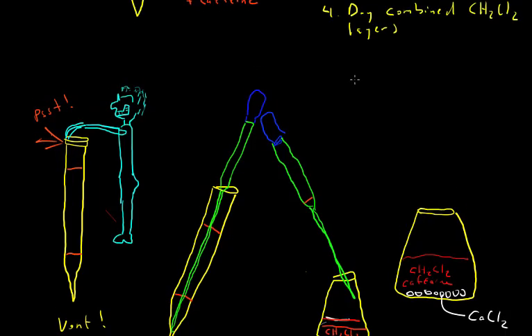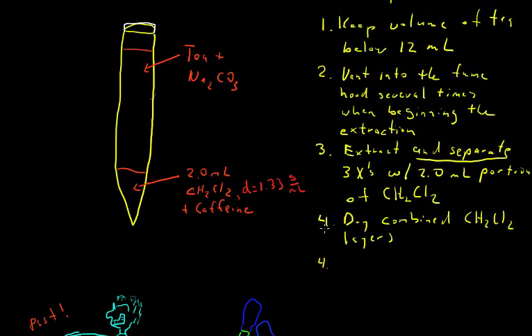One thing I forgot to mention is what to do if you see an emulsion. Emulsions are mixtures of 2 or more immiscible liquids that have been thoroughly mixed, where little tiny droplets of one liquid are thoroughly dispersed into the other liquid. In an emulsion you don't get a nice separation between the 2 phases, you just get this mixture. Milk is an emulsion. Emulsions can be very, very stable. They can sit around for hours, days, weeks, maybe even years without separating.